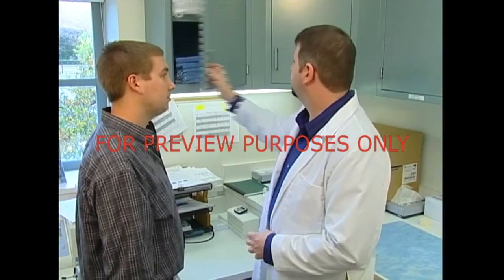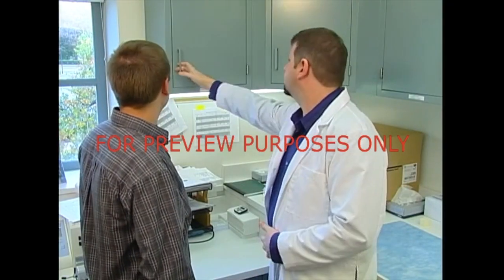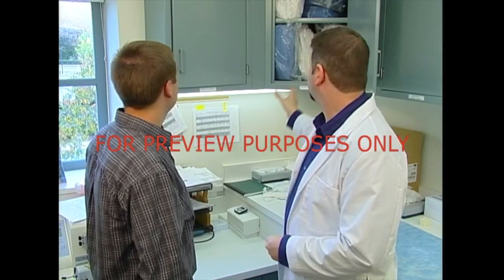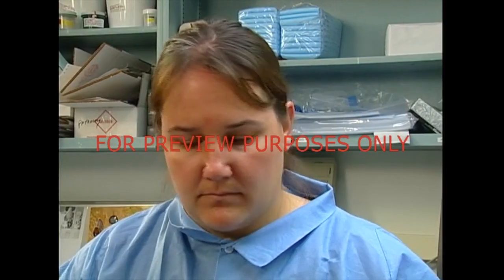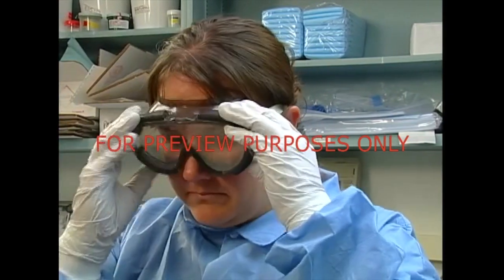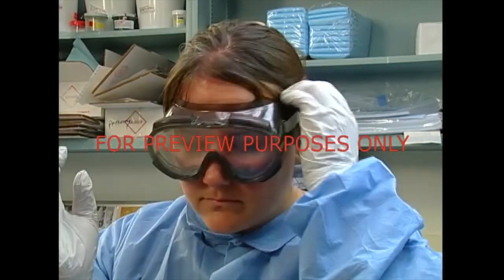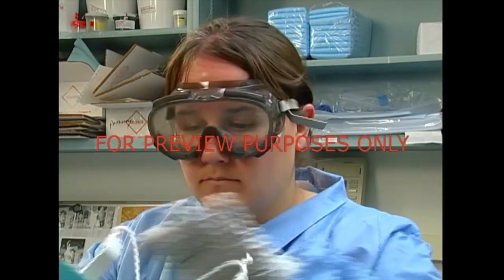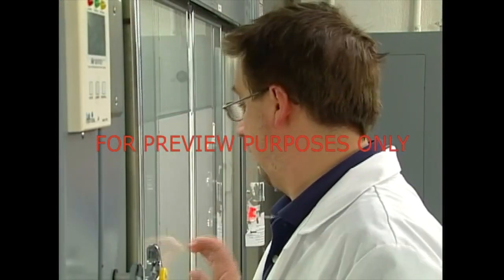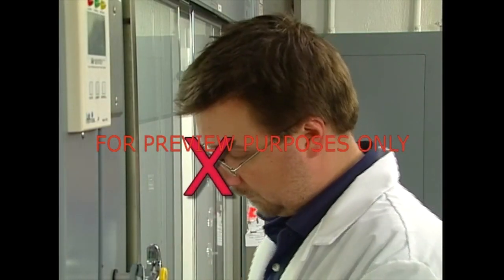Make sure you know where to find it. PPE is often stored in a central location. Any PPE that you need will be supplied at no cost to you. There are many types of PPE. Eyewear, ranging from safety glasses to face shields, is particularly important. Be sure to wear the type or combination that's right for the job you're doing. And remember, regular street glasses are not acceptable.